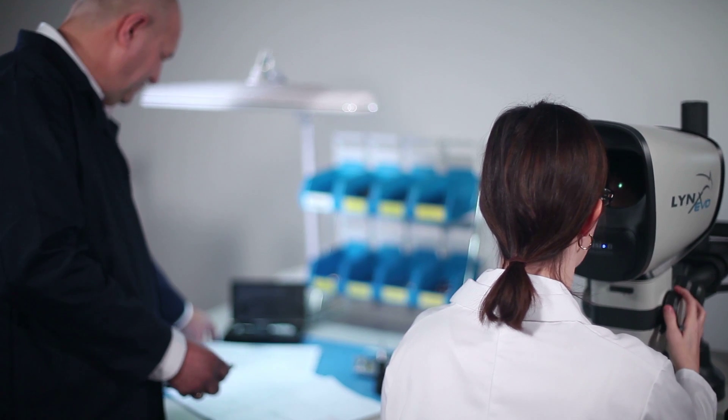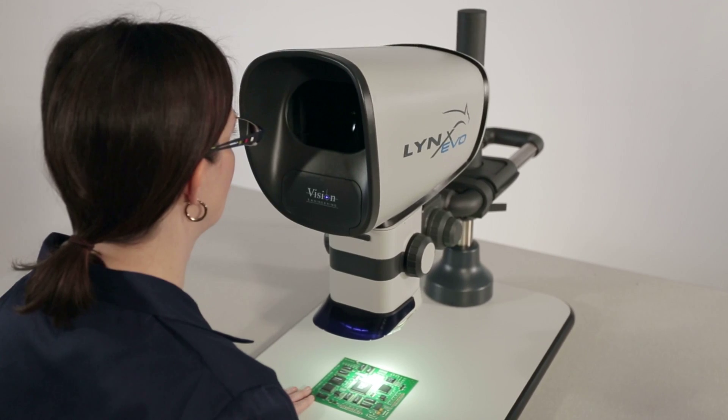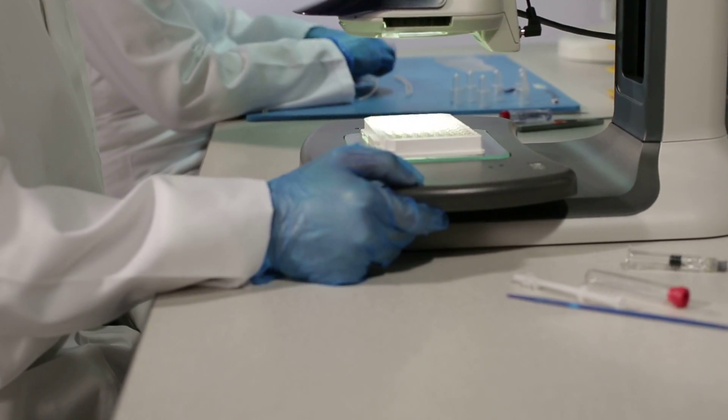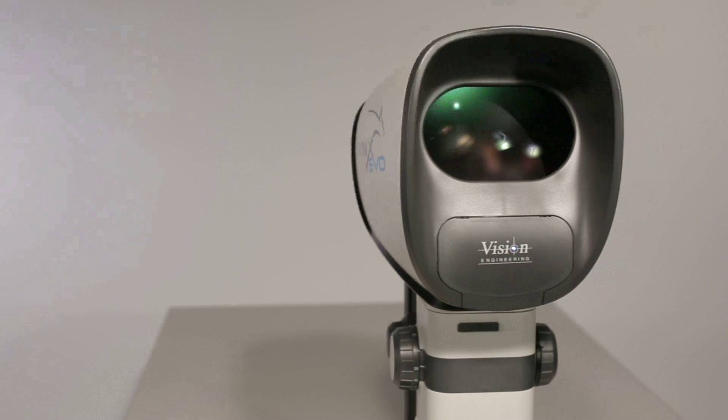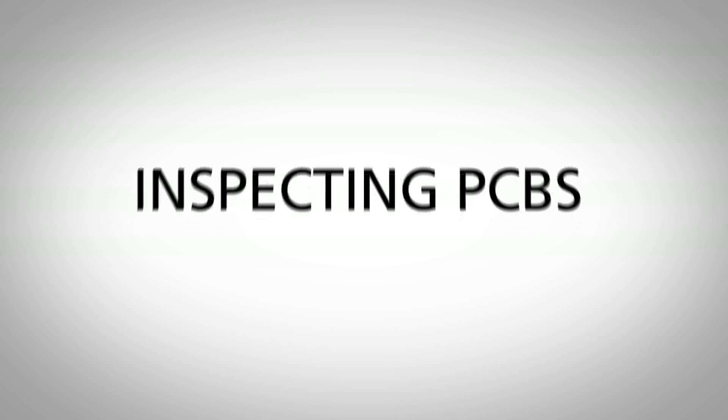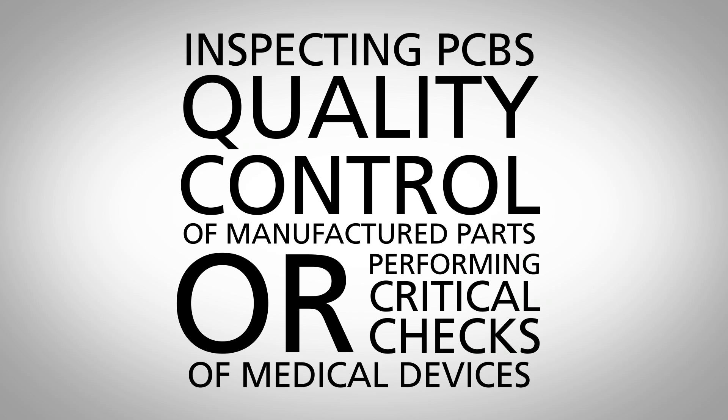Lynx Evo is also extremely versatile, ideal for a wide range of environments, from quality control and production to clean rooms and laboratory work. You can even use Lynx Evo when placed inside a laminar flow cabinet. Whether inspecting PCBs, quality control of manufactured parts, or performing critical checks of medical devices.